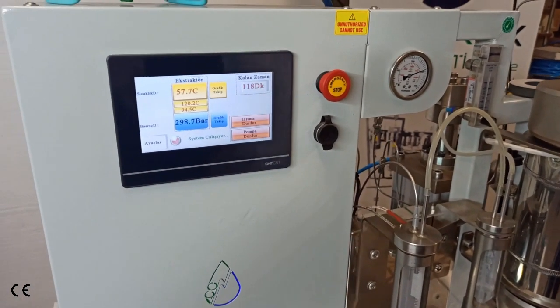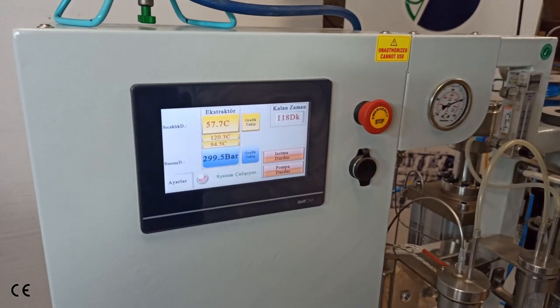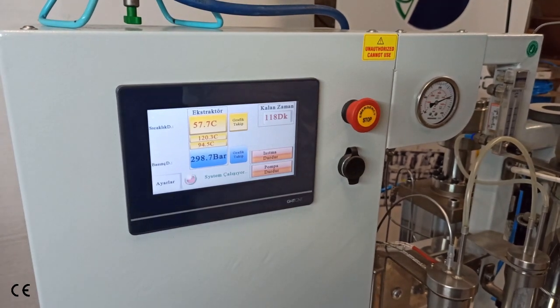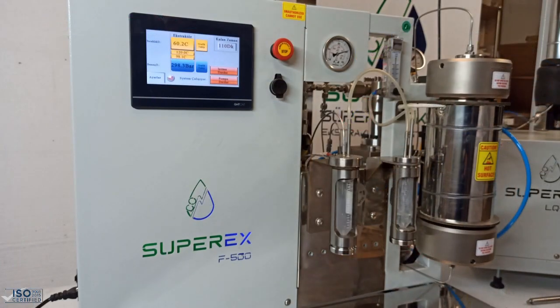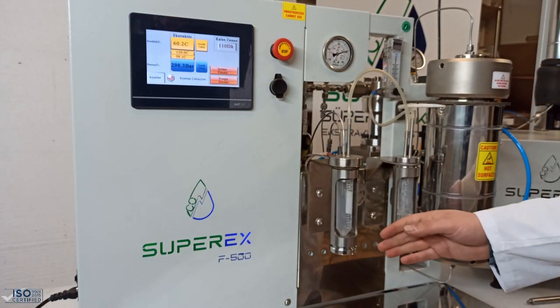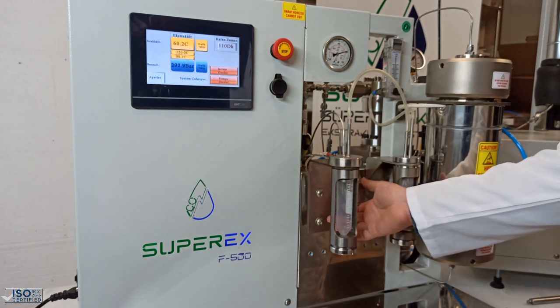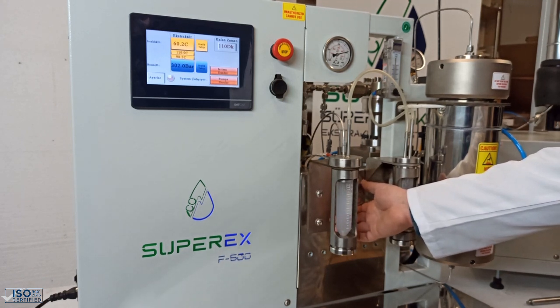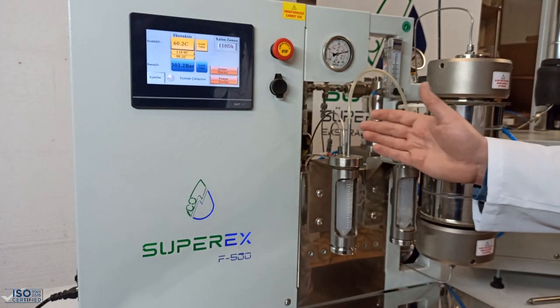We can wait some time for static extraction, or we can start dynamic extraction and flow the R134a. We have waited 10 minutes for static extraction. Now I am starting the dynamic extraction by opening the restriction valve. When I open it, the system pressure decreases and the pump works to maintain the set pressure.